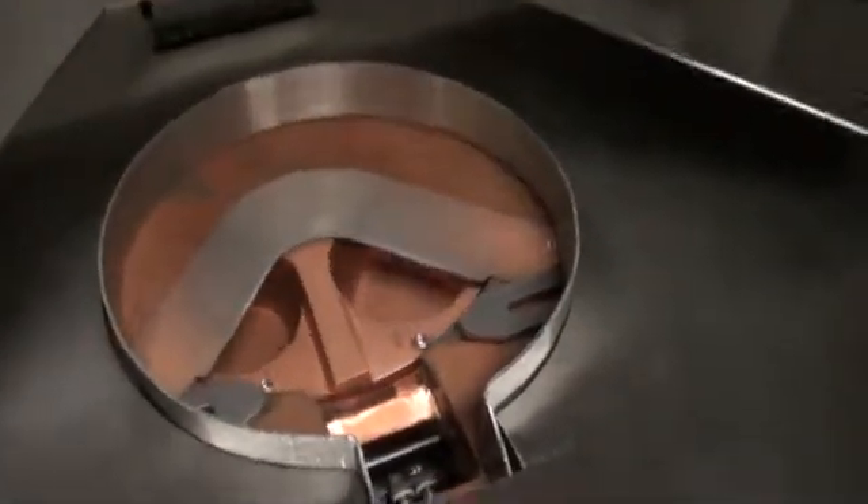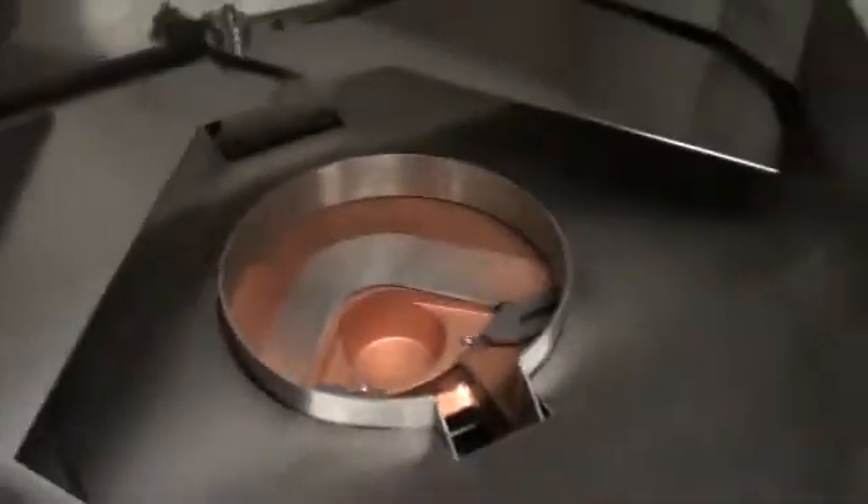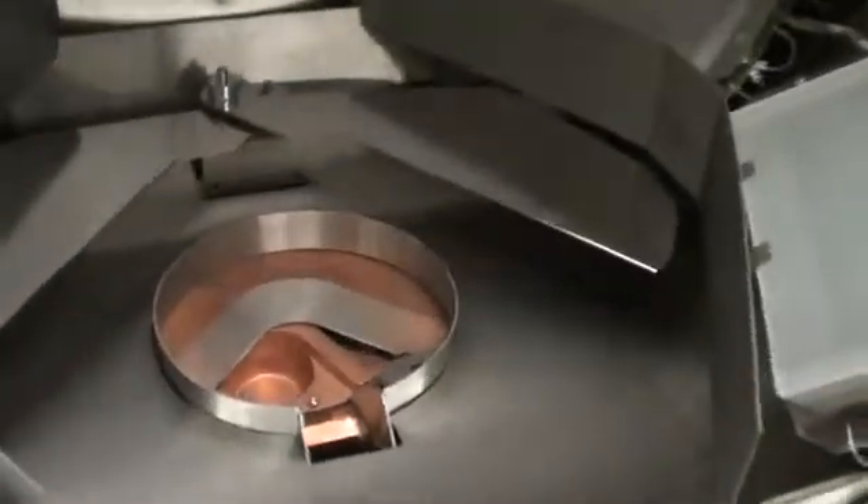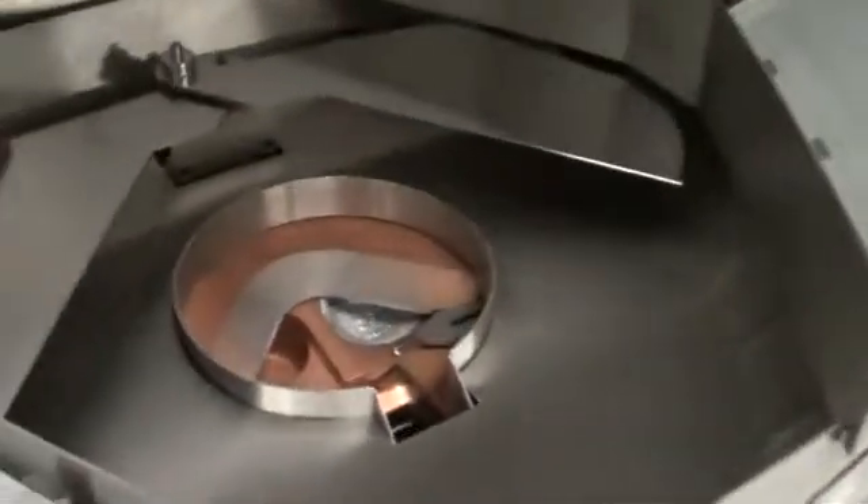We will run some practice depositions prior to shipment. That's pocket three. Pocket four. Back to pocket one. Four pocket — 30 cc pockets. We have a heat shield, a deposition shield to protect the trial fork. That's about it.